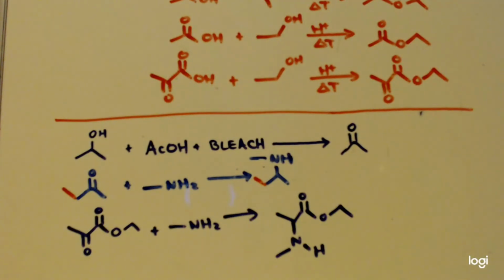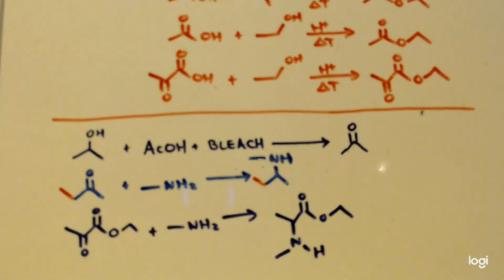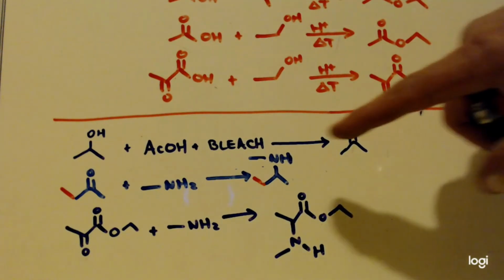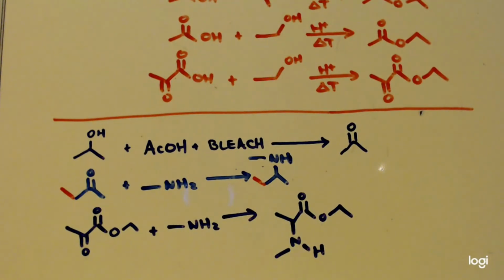And I don't know how to make the catalyst right now or get it, or I don't want to do it because it's a big giant molecule. If anyone wants to know the name of it, I'll give it to you. But you can just use methanol or ethanol and make the appropriate aldehyde. You get really high yields, but you need that catalyst. Because even with making it with a secondary alcohol to make a ketone instead of an aldehyde, I only get about 40% yield, although I'm still playing with it, trying to tweak it. But I'm sure if I had that catalyst, that would give me even higher yield than 40%.